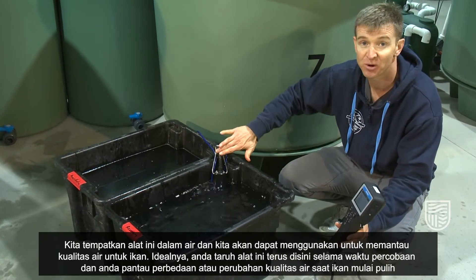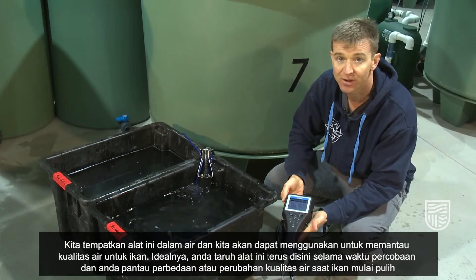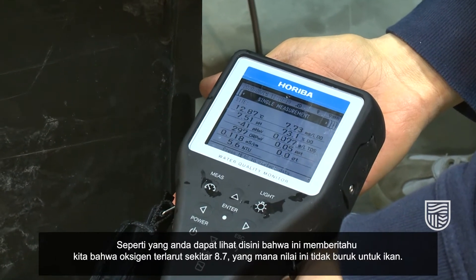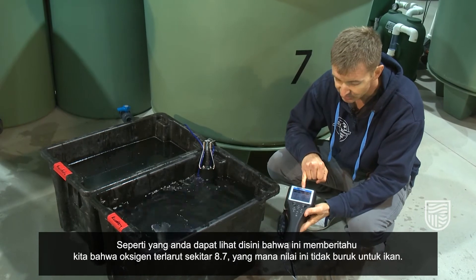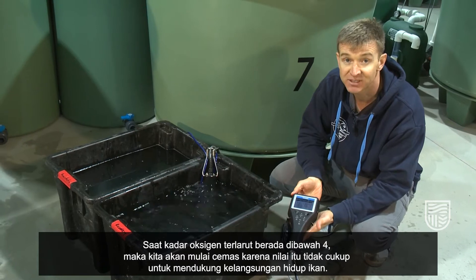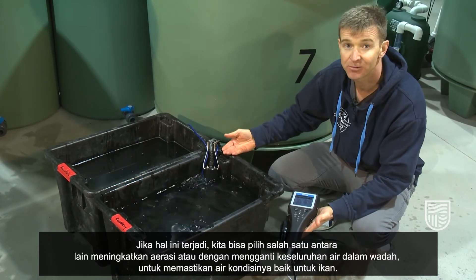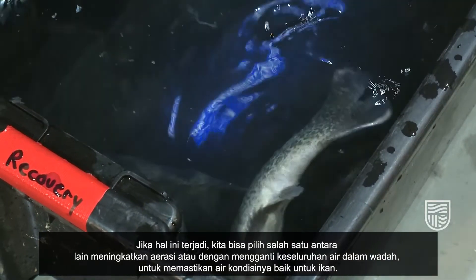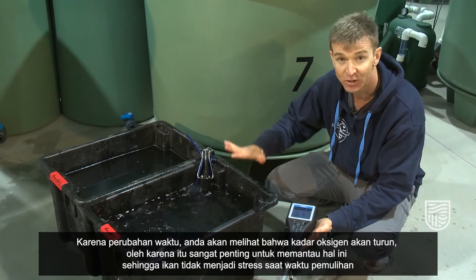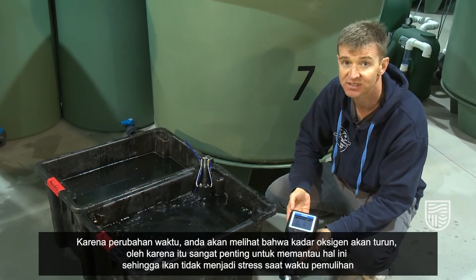Ideally, you would have this probe in the water the entire time and monitor the different levels of the water quality parameters as the fish are recovering. You can see here that it's telling us the dissolved oxygen is around 8.7, which is not too bad for fish. When the dissolved oxygen gets below 4, we start to get worried because that's not enough oxygen to support the fish. If that happened, we'd either increase the aeration or do a full water change to make sure the water is okay. As the day progresses, you would notice the dissolved oxygen goes down, so it's very important to monitor this so that the fish don't become stressed as they recover.